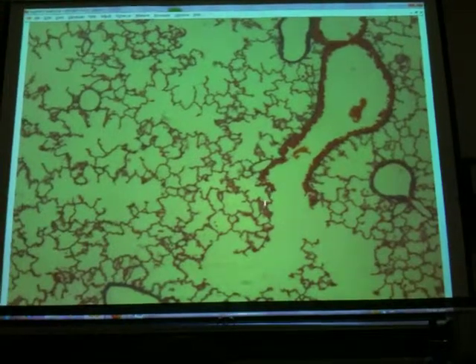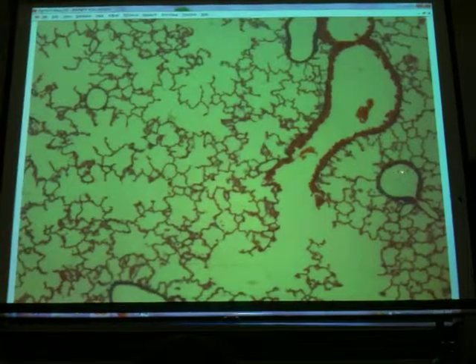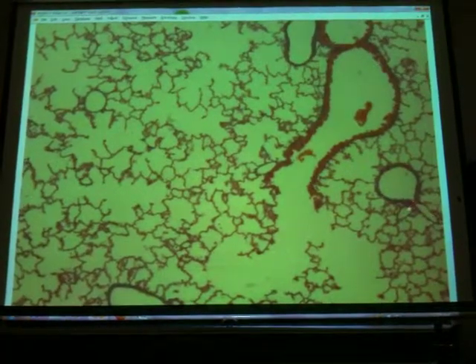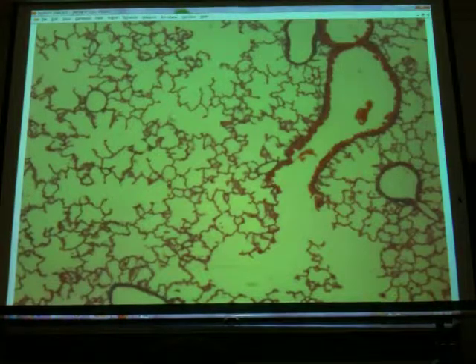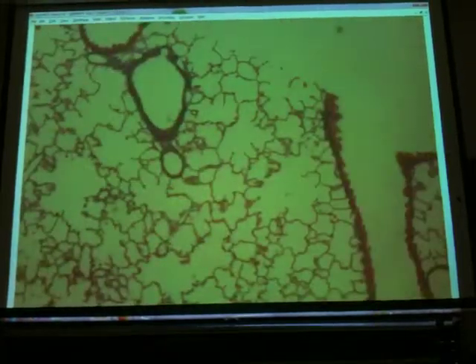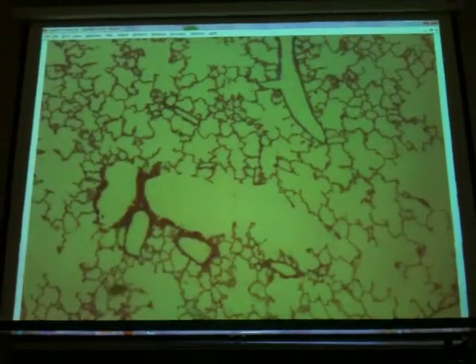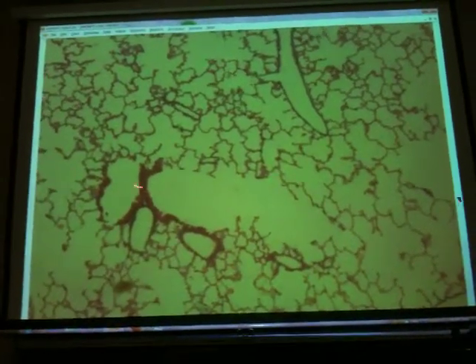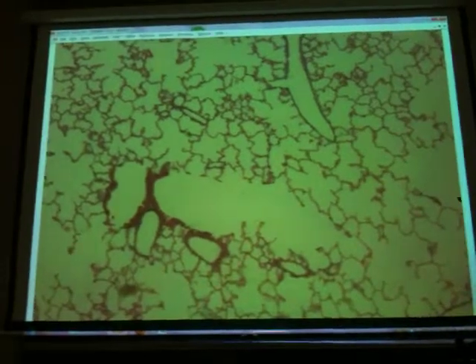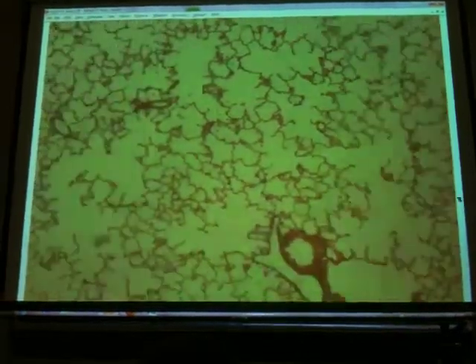So we have the transition in the wall getting thinner, thinner, thinner. All of a sudden, we're in the respiratory exchange membrane. Even this is a bronchiole leading to alveoli there. So I'm going to go around on here for a minute. That thicker, bigger part was the bronchus, and the thinner part was the bronchiole. No, I have not seen a bronchus yet on here, because we've seen no cartilage yet. So that's what I'm scanning for right now, and this may be a slide that doesn't have, nope, we do.